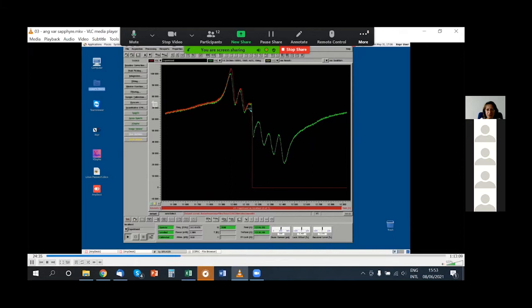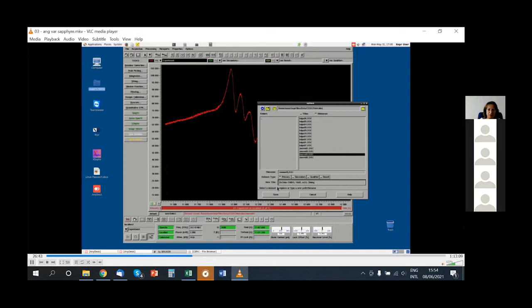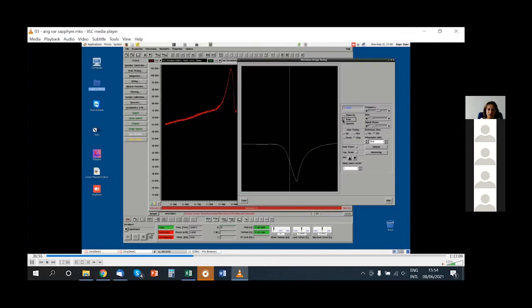We observe now a little higher amplitude, but it is just the effect of the Q factor, which is a bit better for this sample position. And we see here that the narrow line moved from here to here. So this is the first indication that the narrow line belongs to the substrate, which is a single crystal, while the thin film is a nanostructured material.